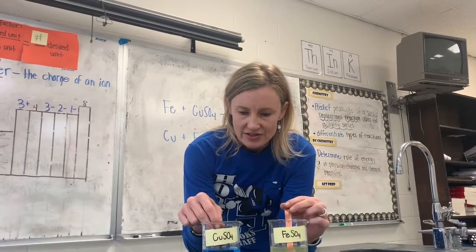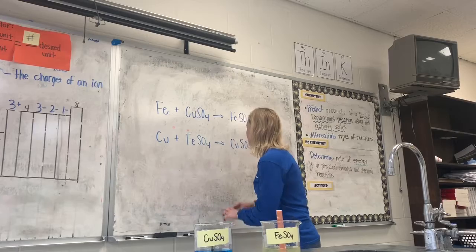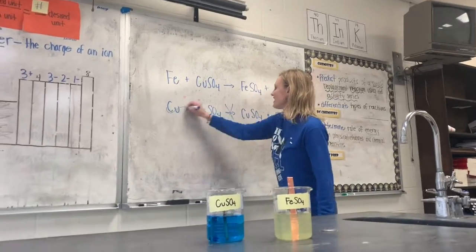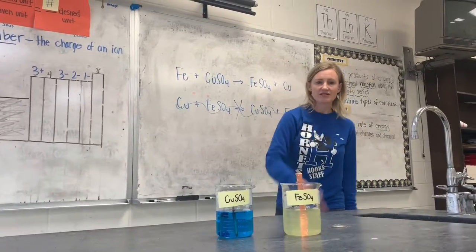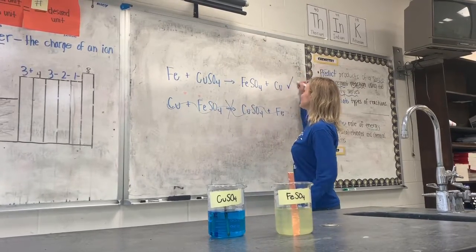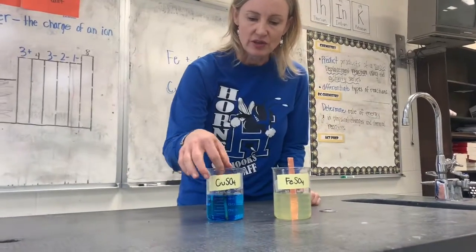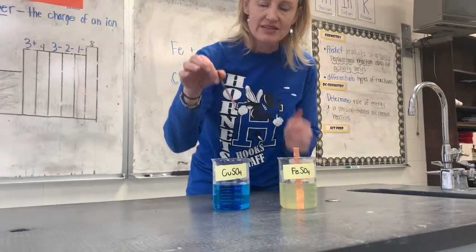So it turns out that this reaction does not happen. This actually does not even happen. That copper can sit in the iron sulfate all day long and it will never form iron, but this one is certainly happening. And after a while, if I leave it in for too long, this blue color will go away because it will all react and I'll have some copper.